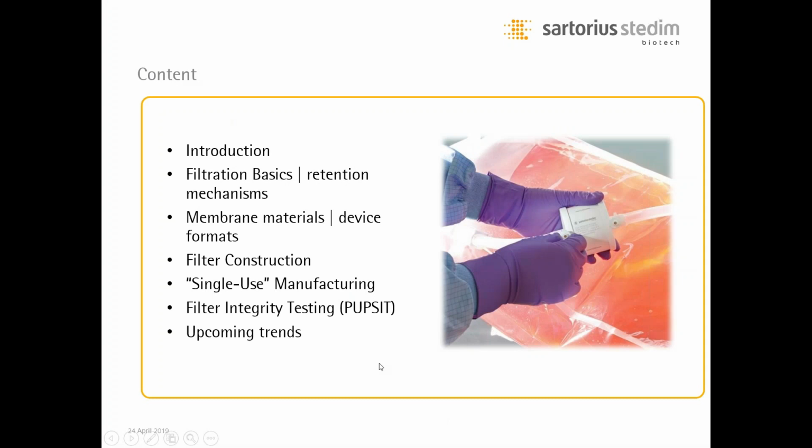So the content for today, I'm currently in the introduction phase: filtration basics, what the retention mechanisms are, membrane materials, what is currently available on the market, and what the trends are when we talk about materials. What kind of device formats do we have to talk about, and filter construction: how is a filter constructed, and what is really important to know, for example, when it comes to dead volumes, when you want to get the highest yield for your process.